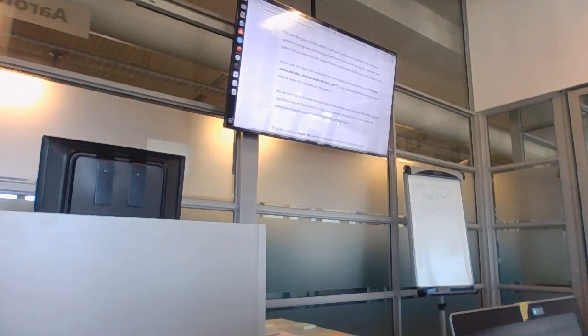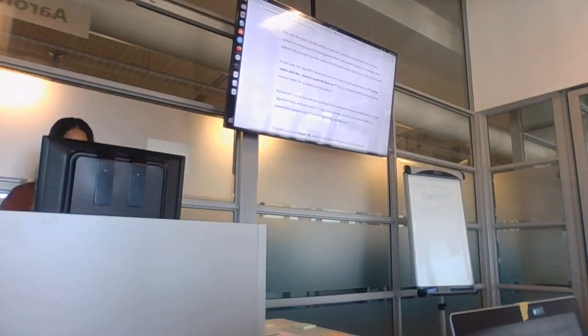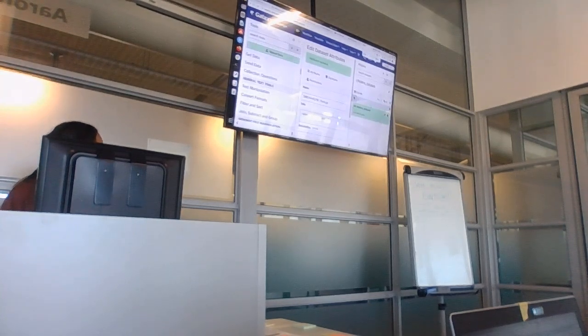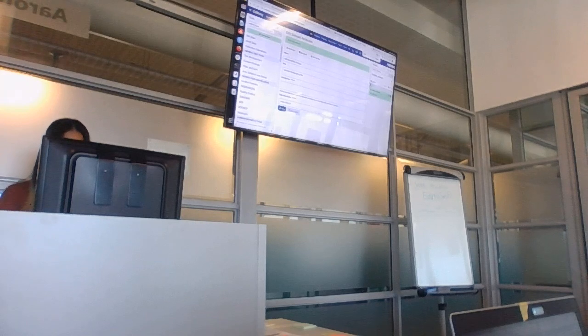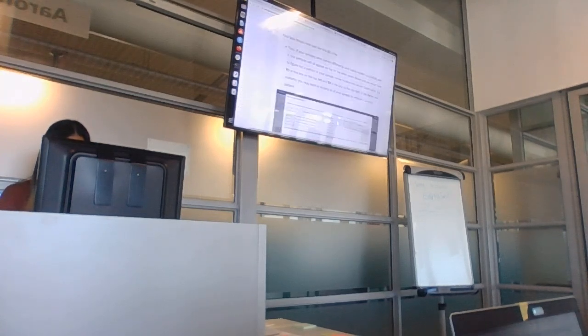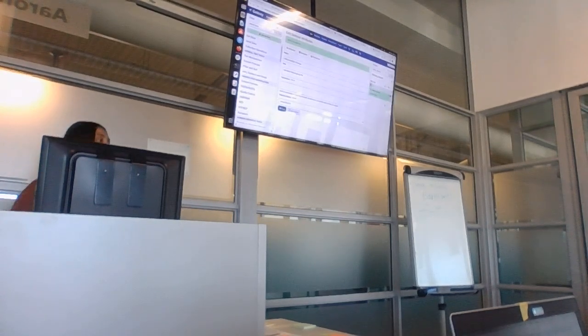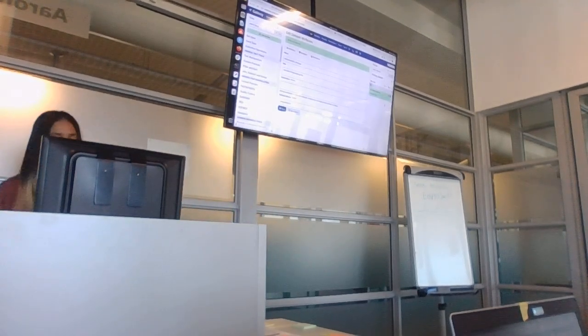So name that at the bottom cholera_dataset, and click on save. Cholera dataset. Cholera_dataset. And now you would have your first dataset in Galaxy with your cholera data. And I think this is going to be a nice short day. And the dataset is done.